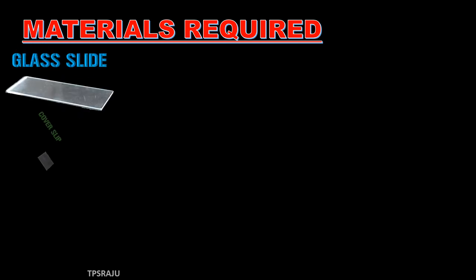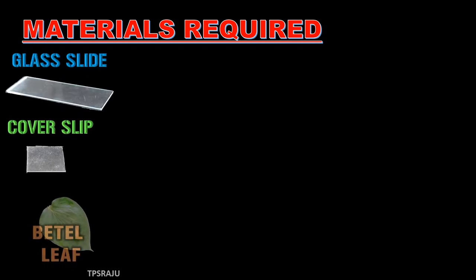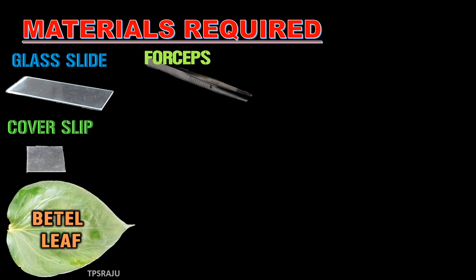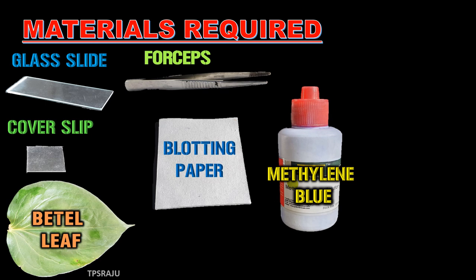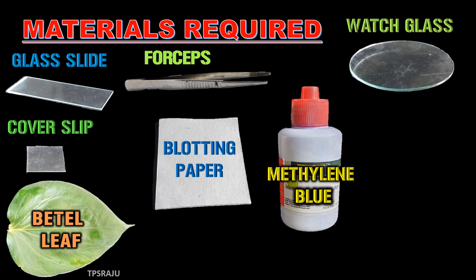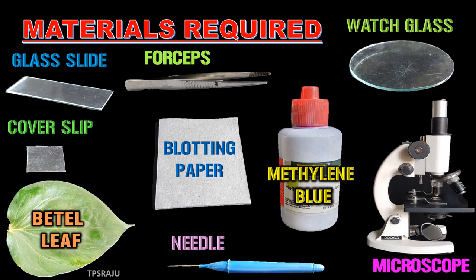To observe stomata in beetle leaf, we require some materials such as glass slide, cover slip, beetle leaf, forceps, blotting paper, methylene blue, watch glass, needle and microscope.